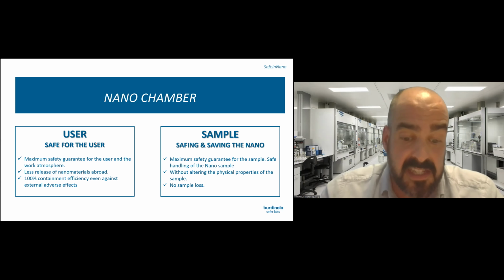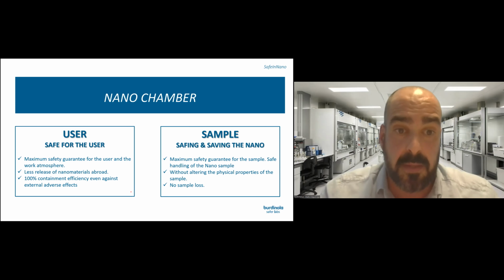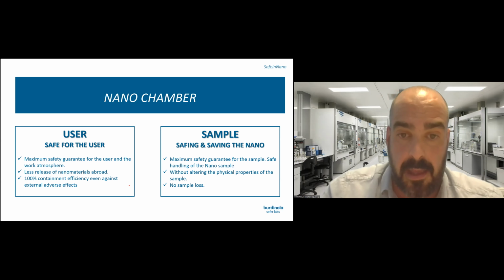There is no air exchange between the user and the inside of the chamber, and the incoming air is filtered. So the sample is always in clean air.